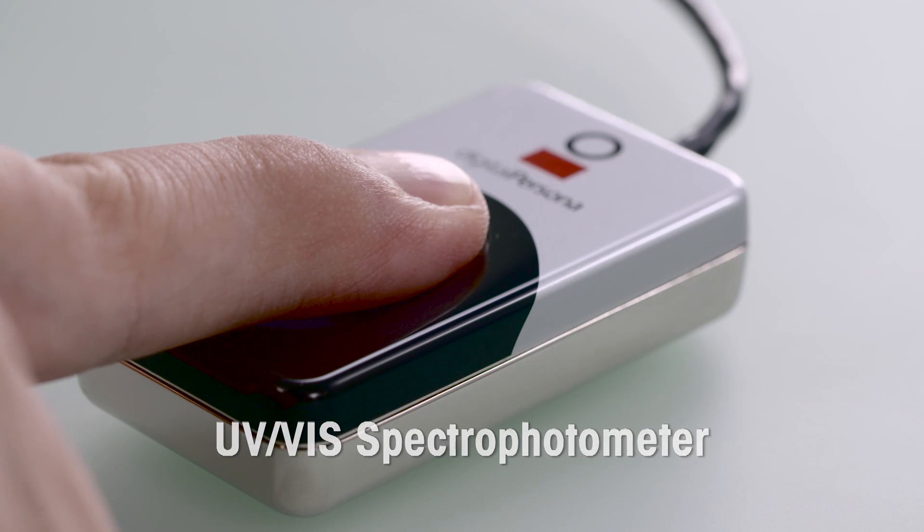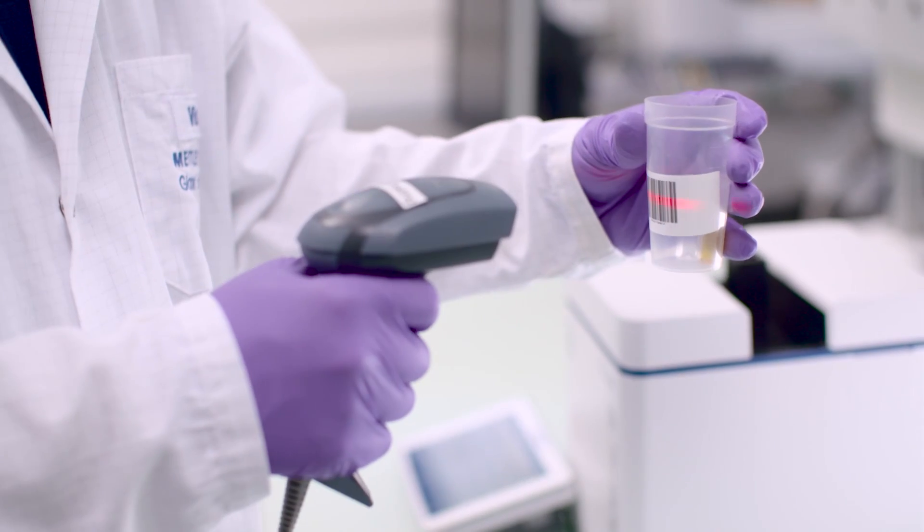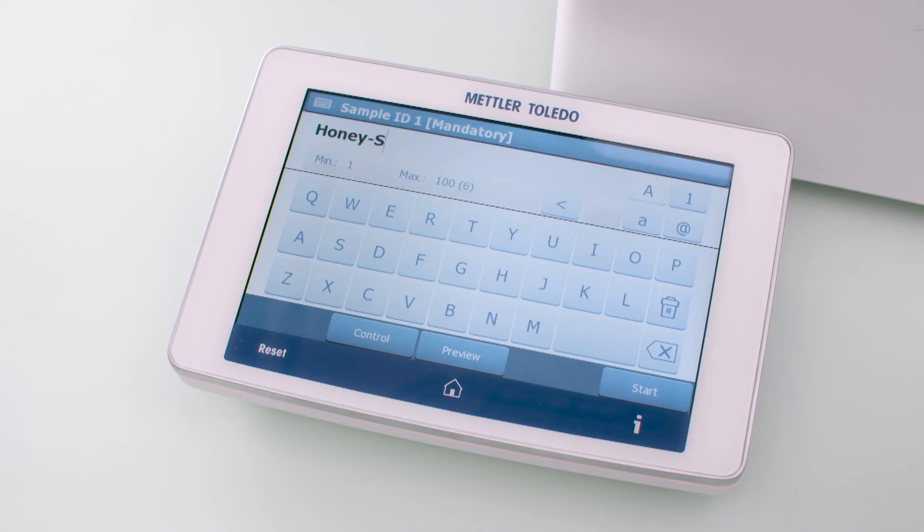The operator simply logs in with the fingerprint and starts the analysis with one click. The prepared sample with the barcode can now be scanned.